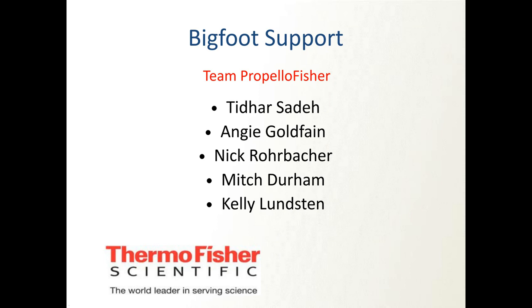So there's going to be a lot of work done. And unfortunately, I'm not capable of doing it all. I know other people are ramping up to where we are right now. There's going to be panel design optimization for the Bigfoot. I think right now everything's optimized for the Cytek, and we've been trying to walk in those same footprints, and it's just not quite the same. So the work for people who want to do sorting on the Bigfoot is figuring out where the commonality splits and what reagents are better biased towards the sorter platform.